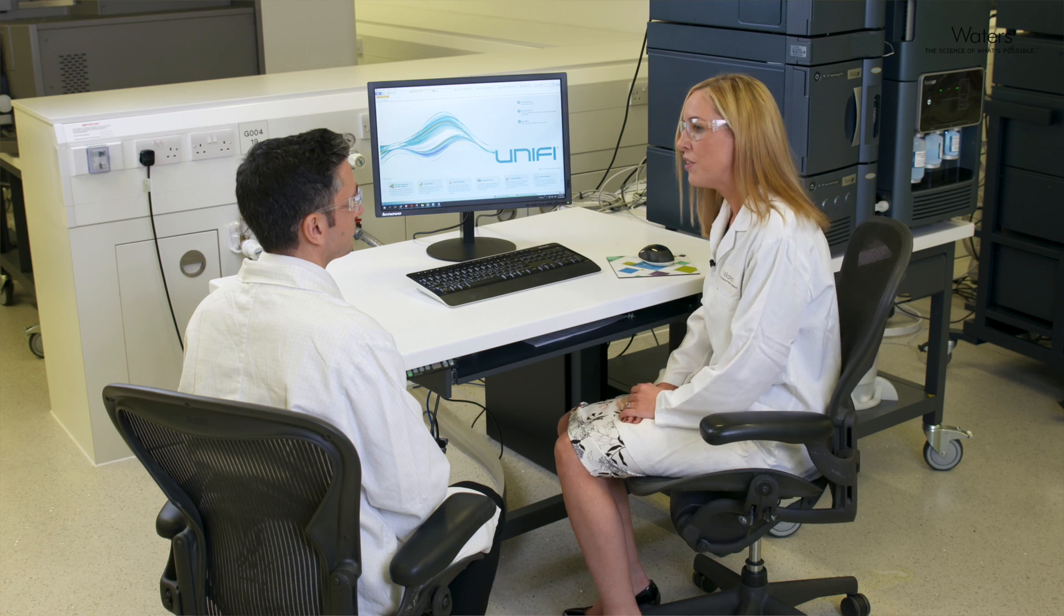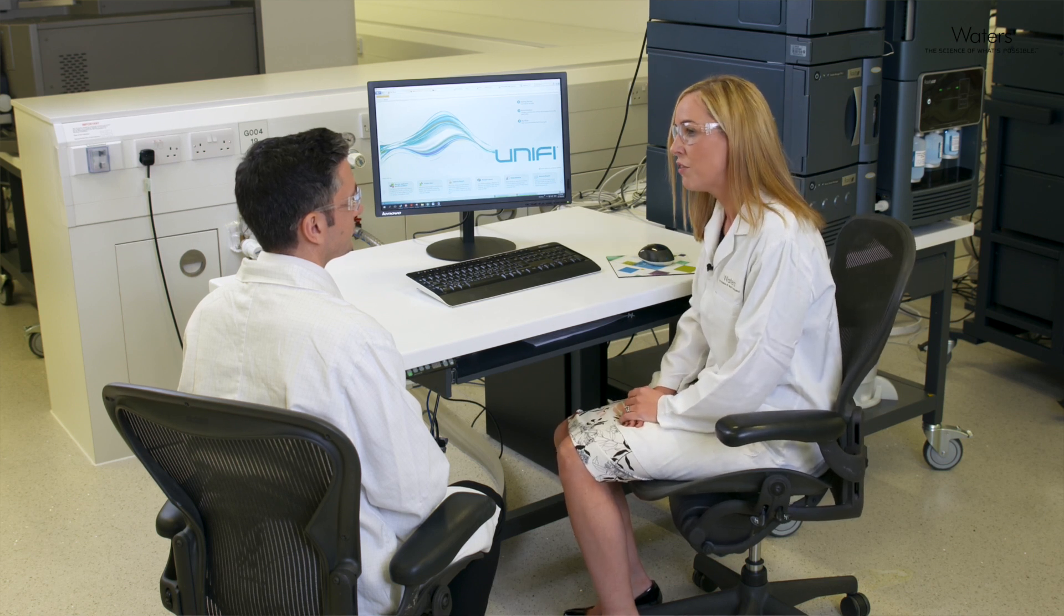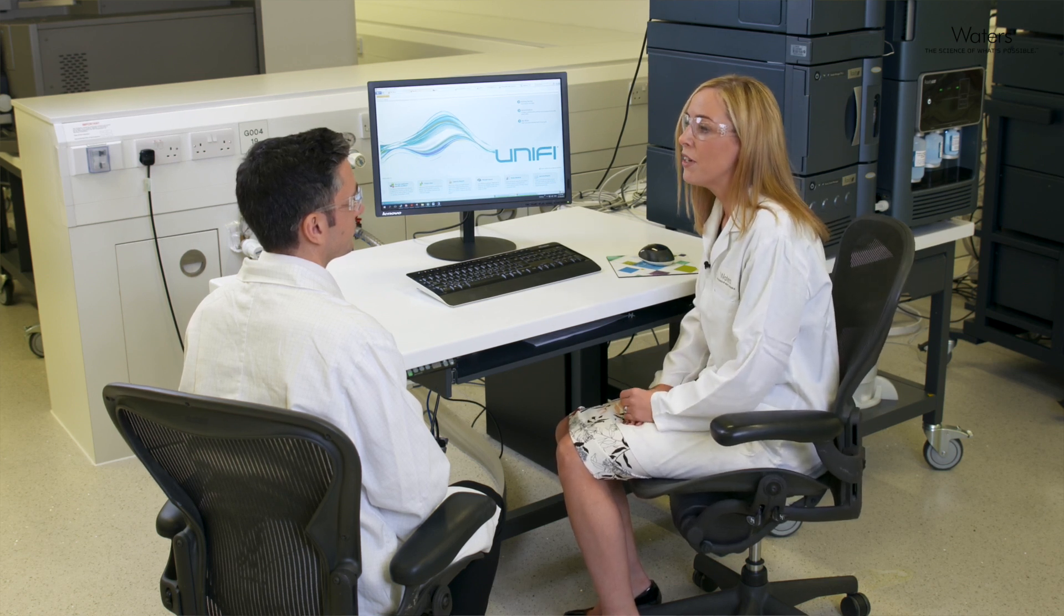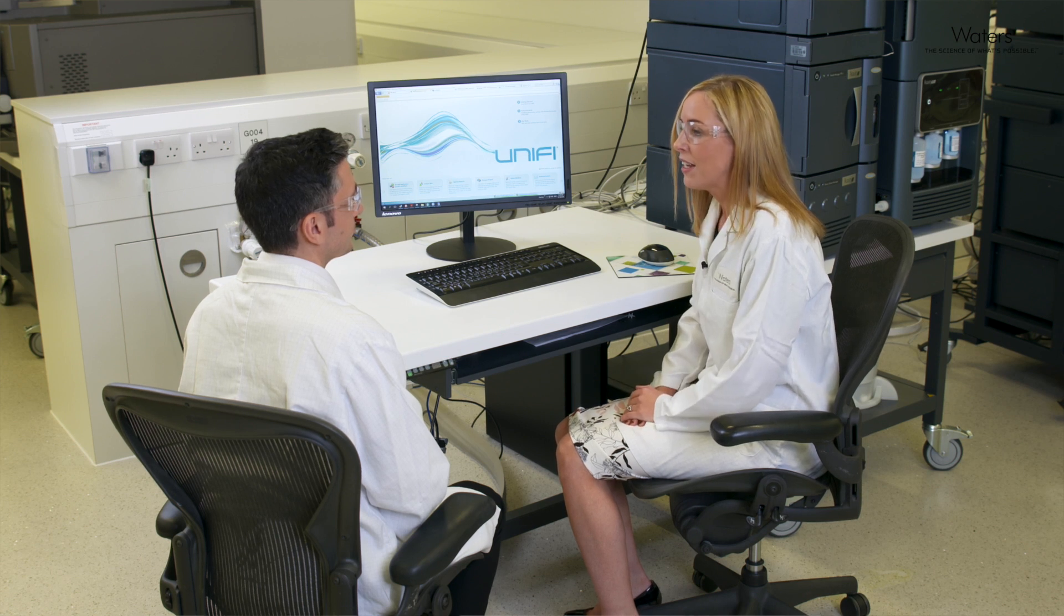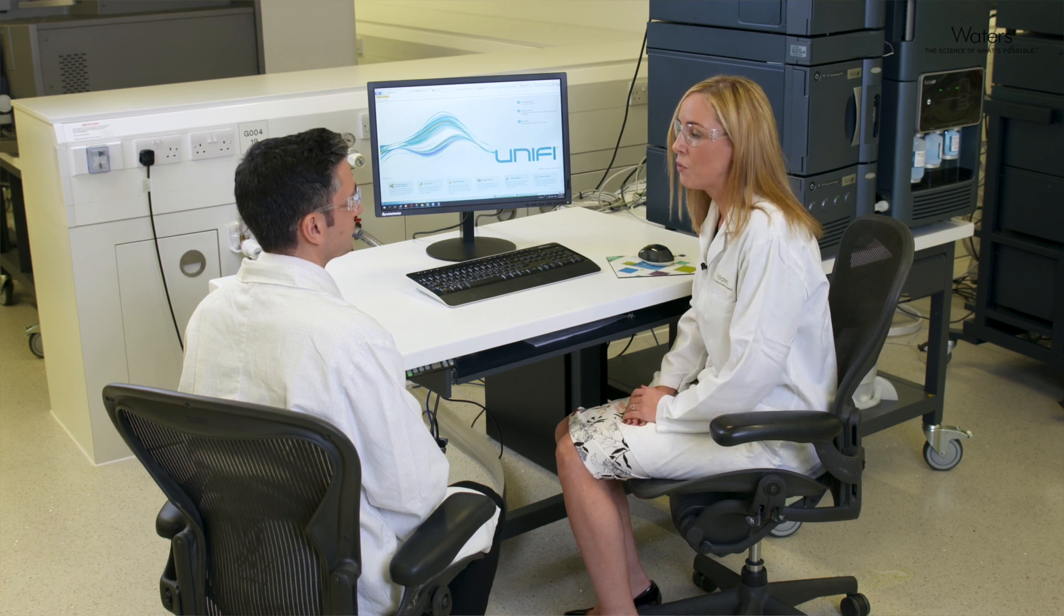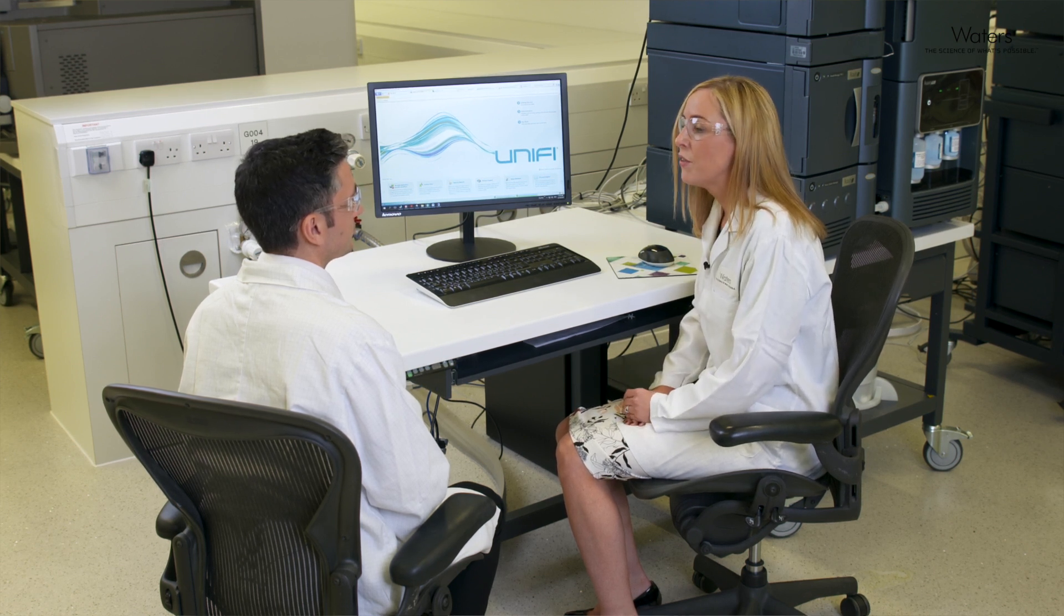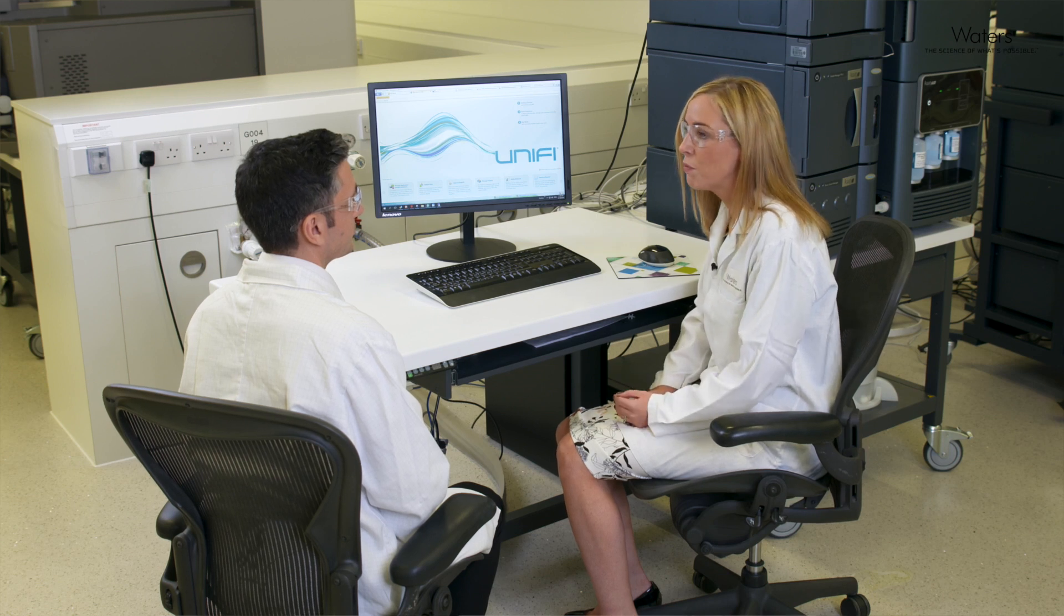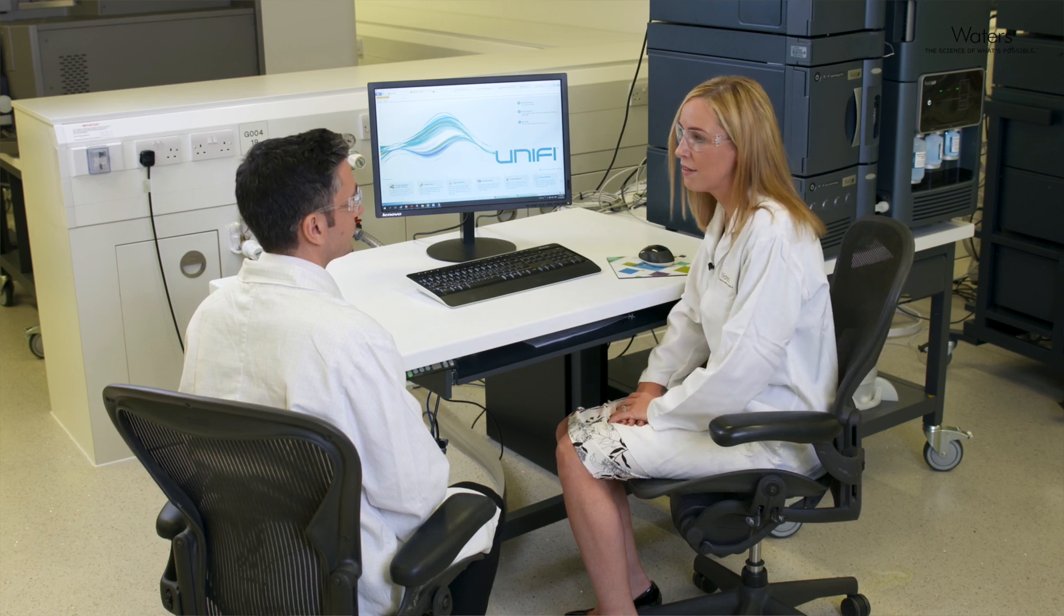So the BioAccord is a robust, easy-to-use platform that even new MS users can use to obtain high-quality data so that you can make quicker decisions and reduce bottlenecks in their daily routines.